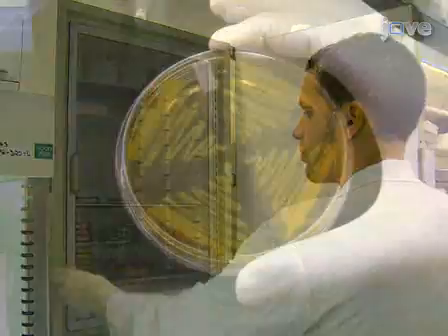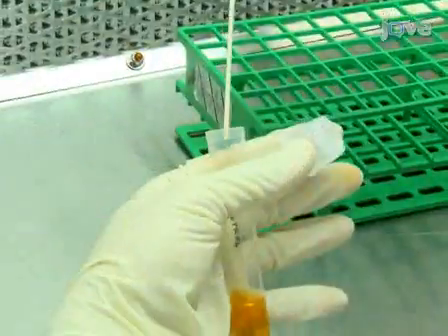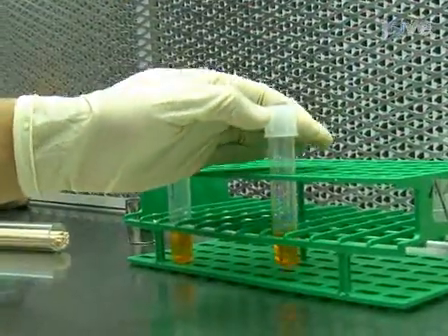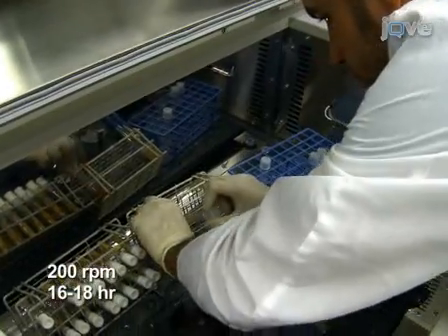When the bacterial colonies have grown on the LB plates, use each of the strains to inoculate four 2 to 3 milliliter cultures of liquid LB containing kanamycin and rifampicin. Incubate the cultures at 30 degrees Celsius with shaking at 200 RPM for 16 to 18 hours.